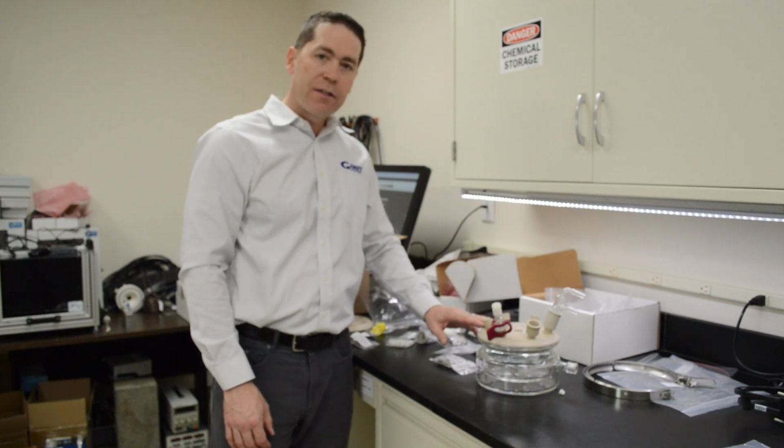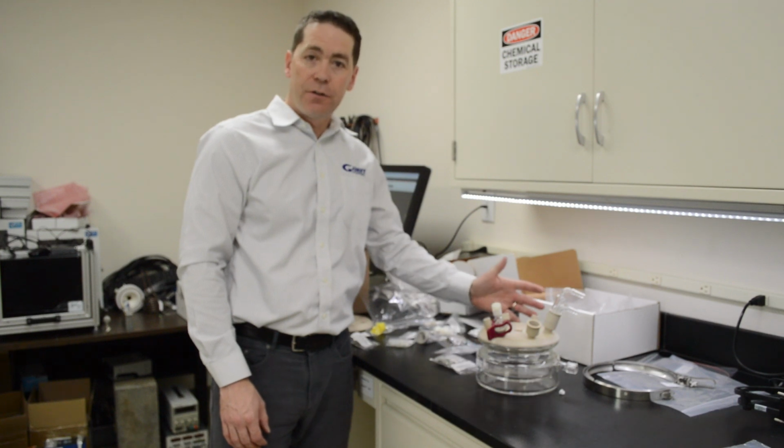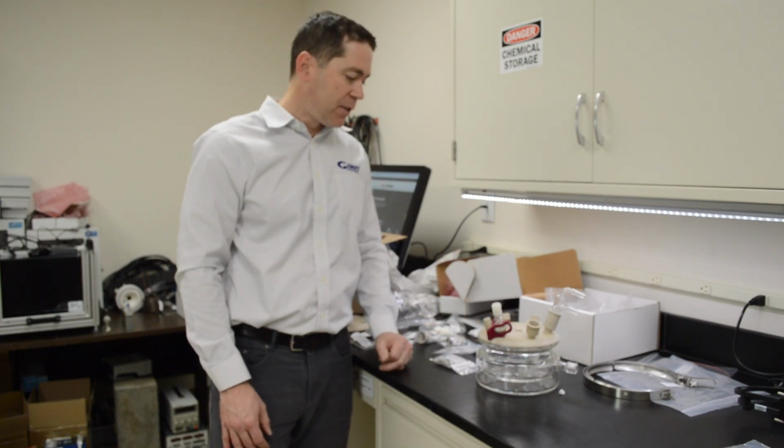This meets ASTM standards for 1 liter. Again, it's jacketed, so you can do temperature control or elevated temperature if you need to.